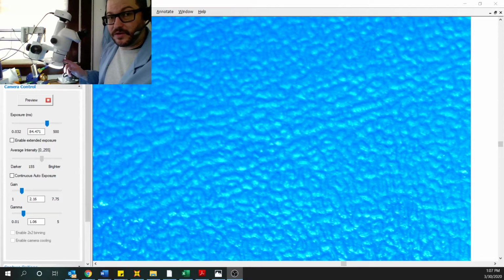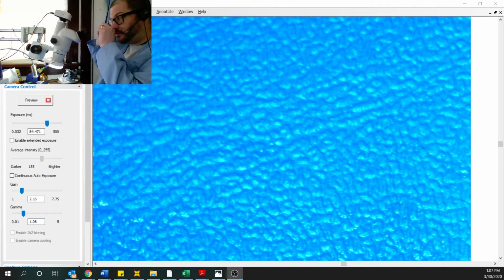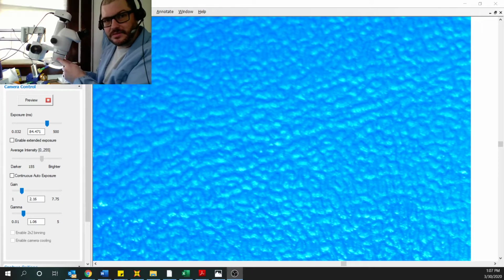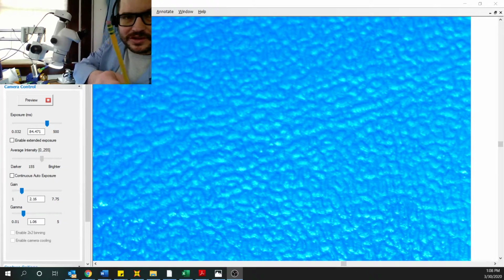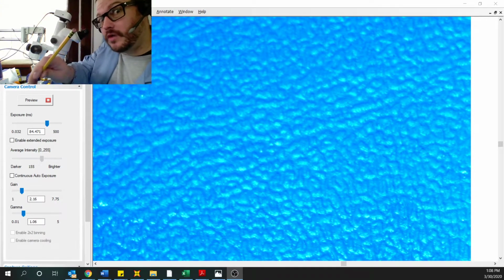The objective lens is the final set of lenses that works with the eyepieces. As I'm looking through the eyepieces, that magnifies it up a little bit, and then it goes through the zoom tube and then down into the objective lens. Light hits off of what I'm looking at here, like, say, for instance, this standard Ticonderoga number two pencil. You can tell you have a pencil like this. We've got several pencils like this all over the place.